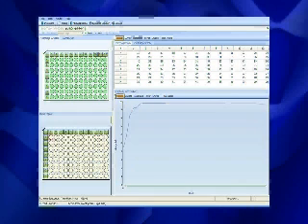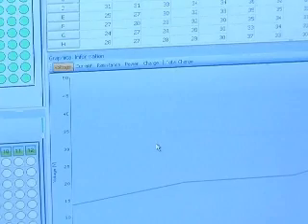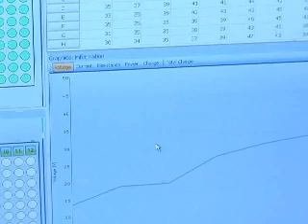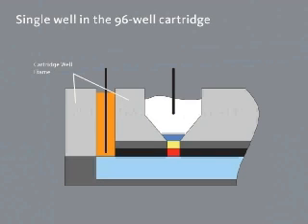Today, I have selected a program that applies 0.5 milliamps of current for 30 minutes. The beauty of the software is that each well can act independently, in essence having up to 96 different experiments going on simultaneously. This is going to run for 30 minutes, so now let me tell you what's going on inside the machine. This animation shows the critical components of a single well of the 96-well cartridge.